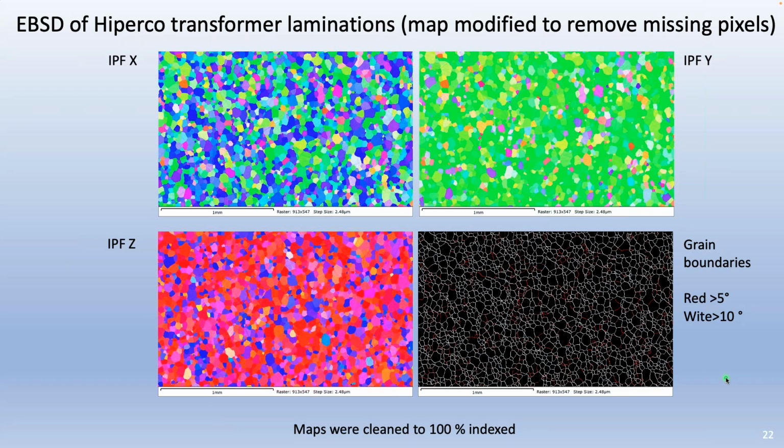So I highly recommend you make a thin piece of silicon, put it in your system, and make sure that what you end up with is what you expect from the orientation of the single crystal silicon you use, just to get started. And at that point, once you're satisfied you know which way X, Y, and Z are in your TKD data set, then it's really a matter of talking about sample prep.